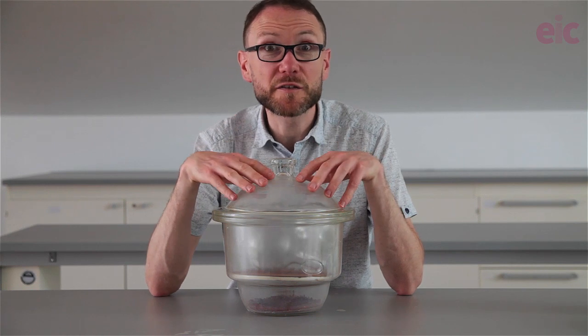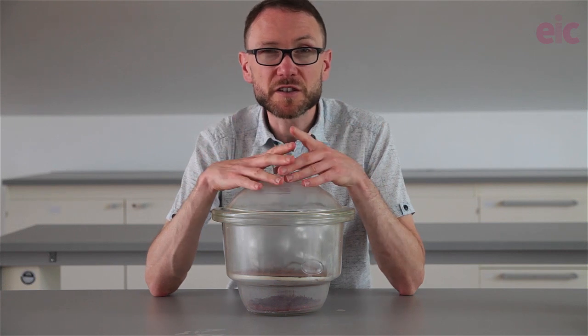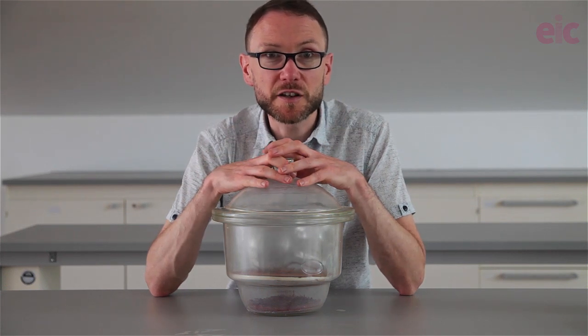I've left some borosilicate flasks up to about 500 cm³ in size in the oven overnight to thoroughly dry. You could also rinse with propanone and leave that to evaporate.